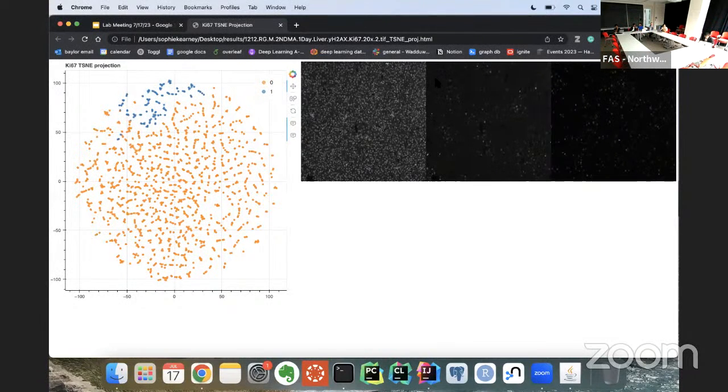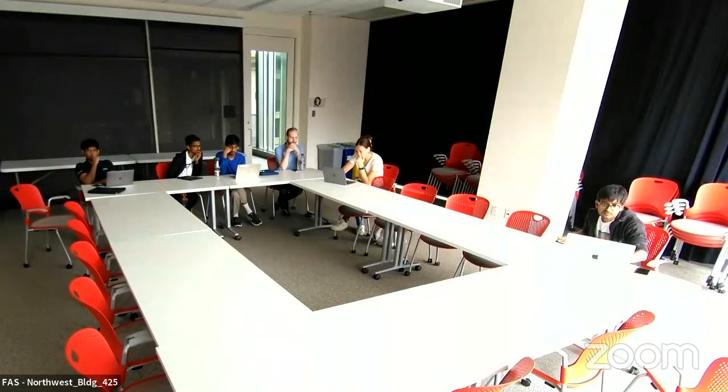Do you have something? Yeah, I'm in the middle of the road right now, but I typed what I heard. It's regarding the choice of the parameters for T-SNE, and also the choice of T-SNE by itself. I don't know whether it's being too mathematical here, depending on the application, but because we are making things interactive, if there was an option for the person to change those hyperparameters, maybe that would be nice.